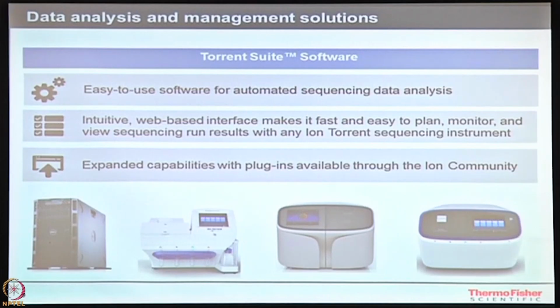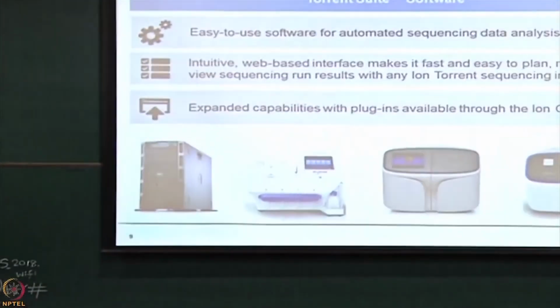So the plugins that are there come into play over here, okay? We have certain plugins which help you understand if the region of interest that you have designed, say I have a BRCA1 region, I wanted to know how many reads are actually aligning to those regions, okay?